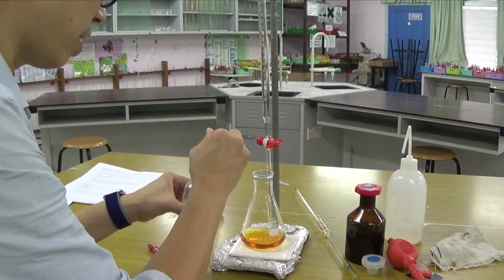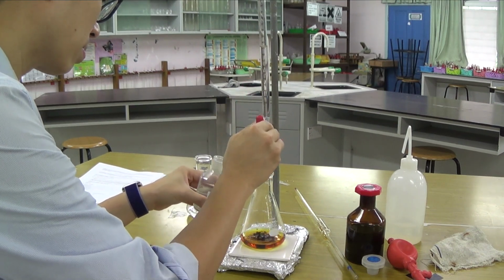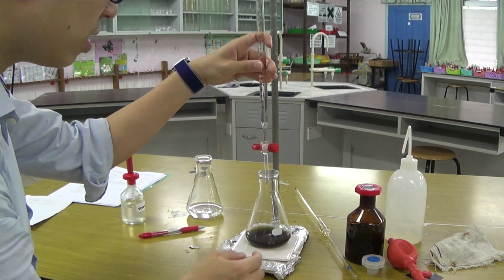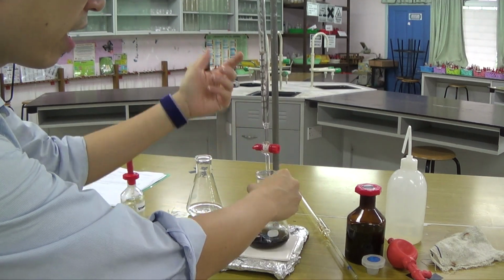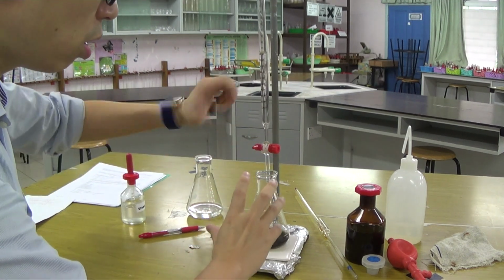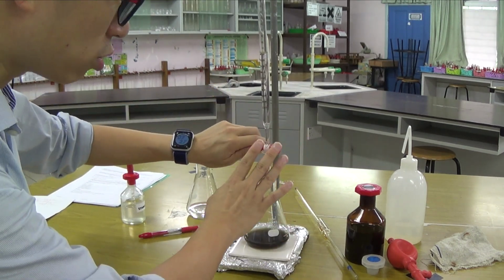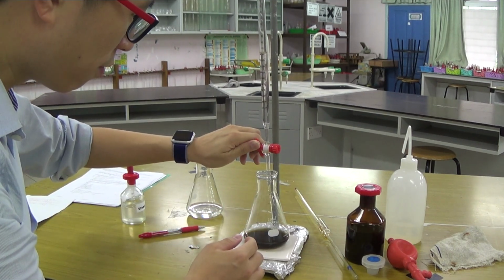So what I'm going to do is add my starch indicator. So 2 or 3 drops, and then it goes blue-black. Now, because I'm right-handed, I am going to swirl with my right, and then I open the tap with my left. I'm very close to the endpoint. I do not want to open and close like that. No sudden movement. Get it drop by drop first. That's the most important thing.